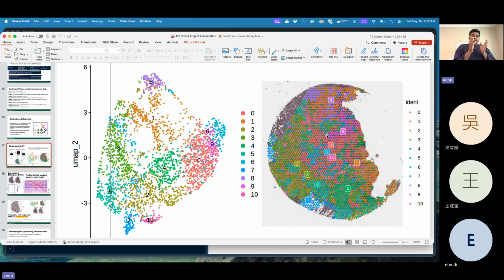Then again these 1,000 spots are made into groups. Okay, these 400, these 300. So these 300 means spot 1, spot 10 and spot 15. These have similar, highly expressed marker genes. So it is assigned as a group, and that is a cluster. It is given as 0, then again it will start from the second one onwards and assign it as 1. I have a better picture, I think, to understand this.